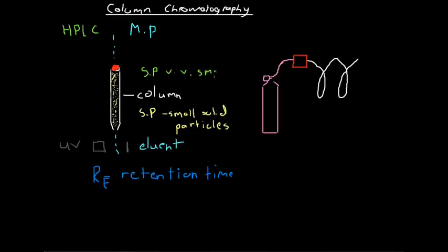And so what this does is, if we have much smaller particles and we still fill the column, there's going to be a much greater total surface area of the particles. If we had one large particle filling the whole column or millions of small particles, there's going to be more total surface area on the millions of small particles than there will be on the one large particle.